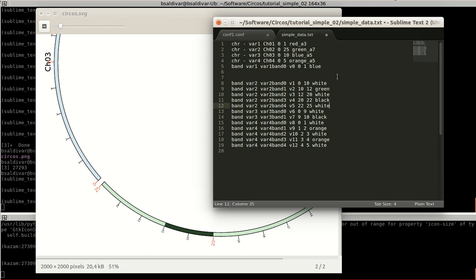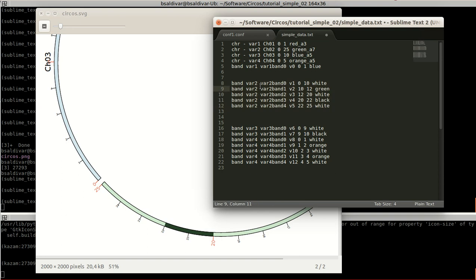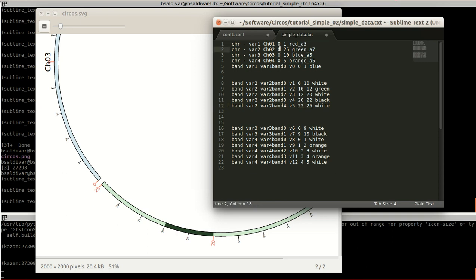We will analyze this other part over here from karyotype 2 that has a length of 25 units. Here, everything that has in common are the first two words. Later, we specify a different variable name for each band. And then you see that it goes from 0 to 10, 10 to 12, 12 to 20, 20 to 22, and 22 to 25. It's required to remember that we must cover all the length, the complete length with bands.